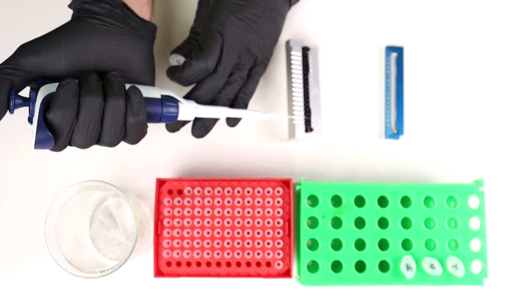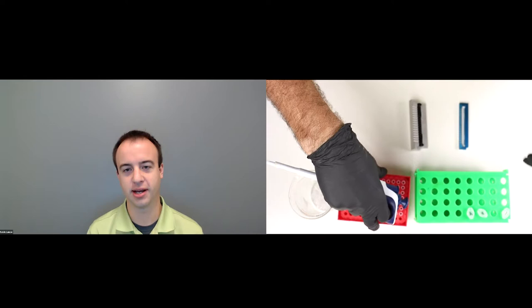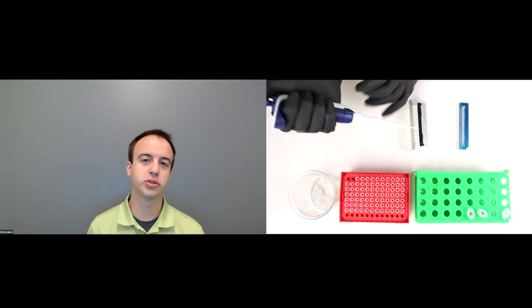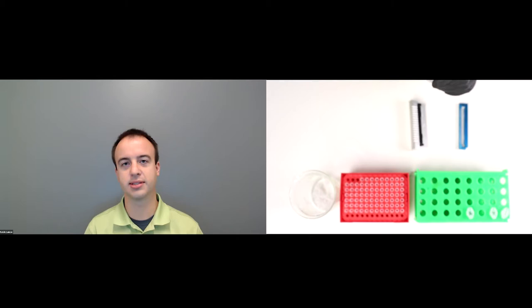While Ross loads samples, another really common experiment that UNCLE can shine at is isothermal testing, which helps you test at higher stable temperatures to see exactly how unfolding and aggregation occur over time. So you might hold your sample at 37, 40, 45 degrees, or even set based on the onset of unfolding or melting temperature, and see what's going on with full spectrum fluorescence, static light scattering, and DLS all gathered at the same time, up to about a week.